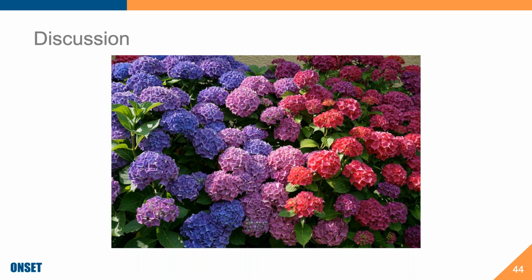You do not take in situ water samples to calibrate the MX2501. That's not quite how calibration works with pH. We do have a conductivity logger where you deploy it and you take an in situ measurement at the beginning of deployment, maybe in the middle of deployment, and then maybe at the end of deployment, and it'll, quote unquote, calibrate the conductivity readings to that. This is not how our pH electrode works. To calibrate it, we definitely recommend using calibration buffers.